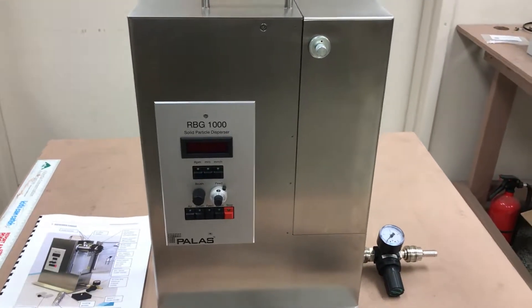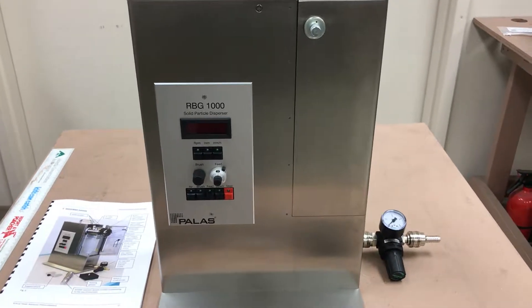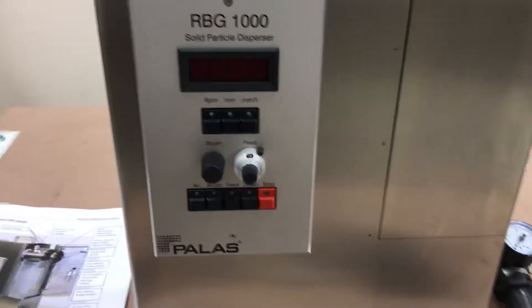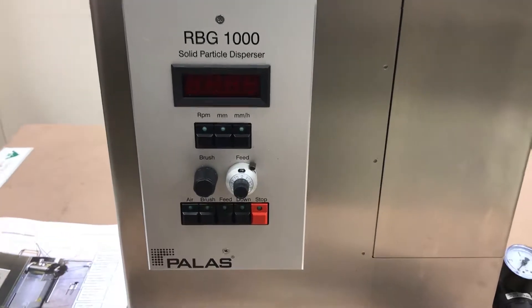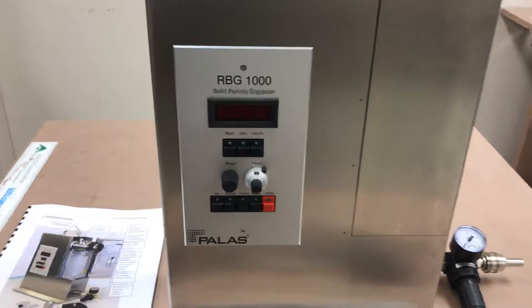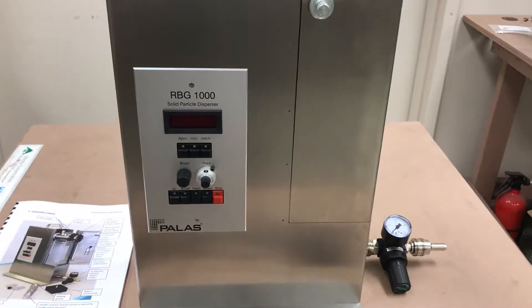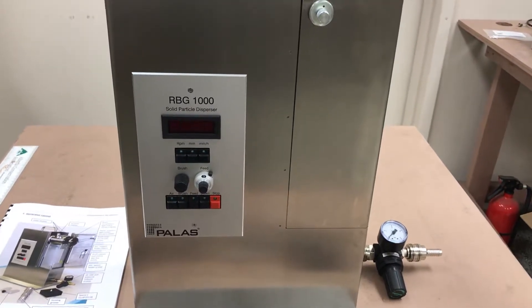Hi everyone, Jim with CDNova again. Today we're looking at the RBG1000 solid particle disperser. This unit is made by a company called Pallas out of Karlsruhe, Germany, located just south of Frankfurt. This unit is used to test filters using powder, spores, and that sort of thing. Salts — I've seen NACL and KCL salt media mentioned for use with this unit.